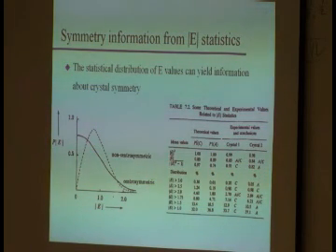Your E values themselves could make a little more of a difference, right? Because the E squared is what is really normalized. So there should be some difference. Predicted is 0.8 and 0.89. Most crystals don't do you the favor of letting you distinguish centrosymmetricity by that.